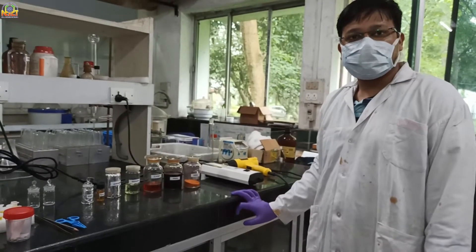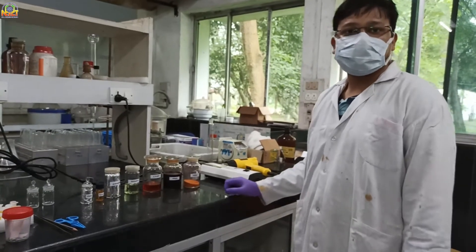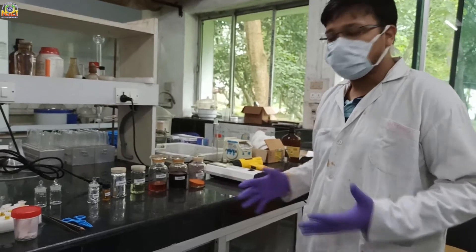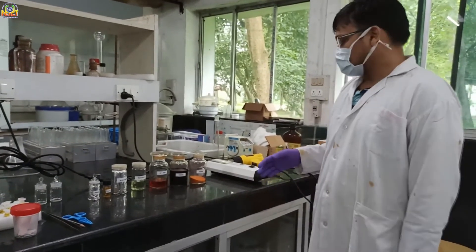Hello friends, myself Gaurakumar Astoghi, working in Applied Organic Chemistry Division. Today I'm going to show you how we are looking at organic compounds on TLC plates.